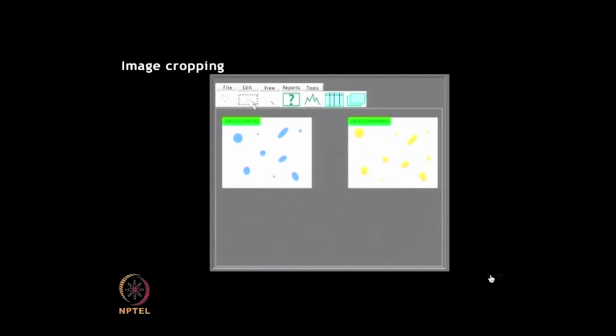You can save the gel images and then you can crop the area depending upon what area you want to analyze. There are several tools available for the analysis of the gel. It is possible to crop the gels by selecting a specific region that is to be studied and then selecting the crop gel function. Cropping the gel helps in selecting regions with high spot density or in reducing regions which contain high background stain with no spots.